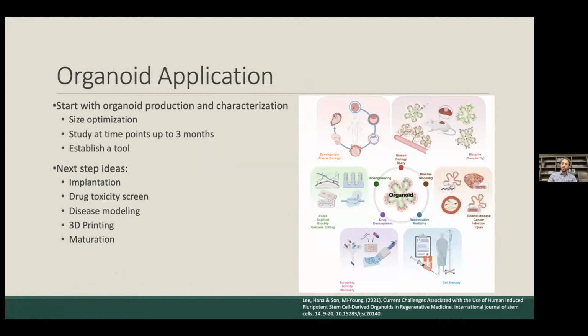So we then wanted to say, okay, well, now we have these 3D spheroids without having to dissociate them or turn them back into this traditional monolayer method. Can we then take those and form larger, more organotypic structures? And we did this through the addition of other cell types. And these organoids, as many of you know in the fields of lung organoids, or liver organoids, is another field where this is being used.